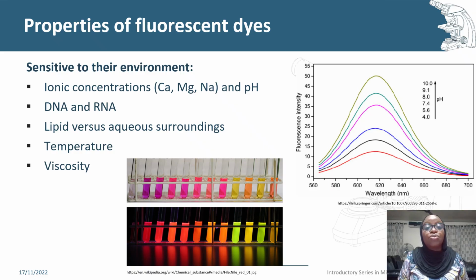They can also give ionic concentrations of calcium, magnesium, and sodium. They also report lipid versus aqueous surroundings. They can also report temperatures and viscosities. This image shows Nile red under visible and UV light in different solvents and pH levels.